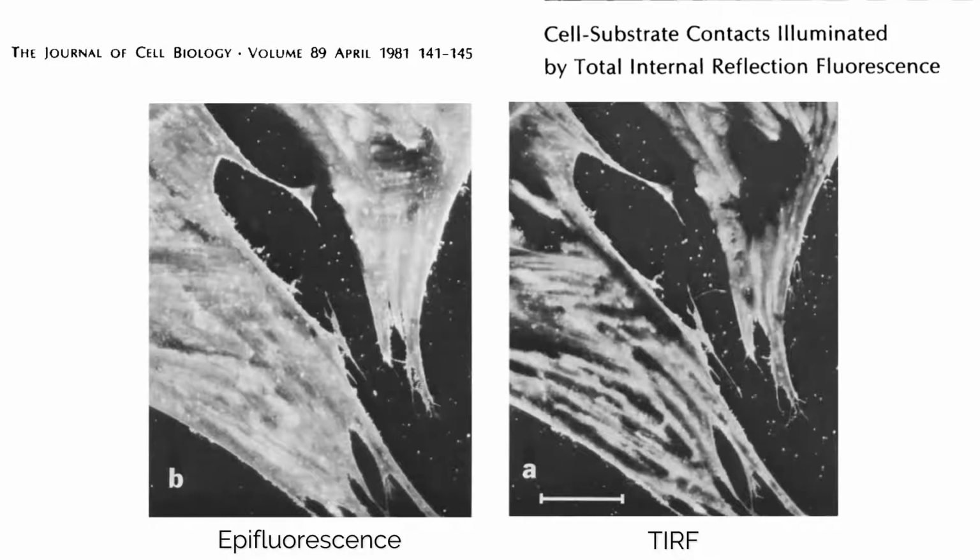And here are the associated micrographs of that pioneering study by Axelrod, originally presented in the Journal of Cell Biology. On the left, we see the regular wide-field epifluorescence image of this kind of specimen, and on the right, the corresponding TIRF image of the sample is shown. In wide-field epifluorescence, the cells mostly appear solid with little to no contrast against the dark background, but under TIR illumination, the non-even contact regions of the cell become readily apparent.